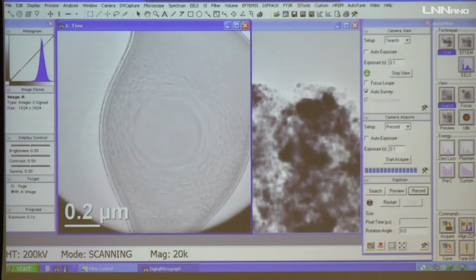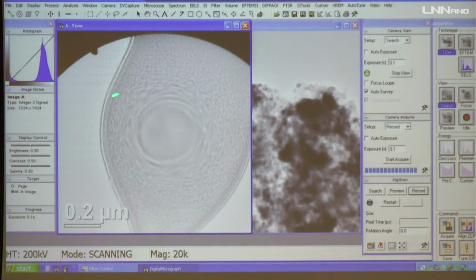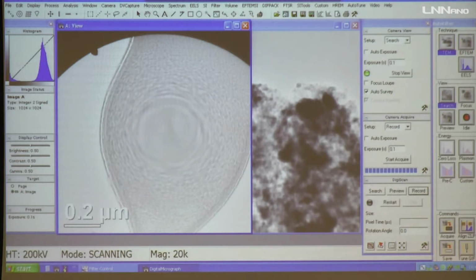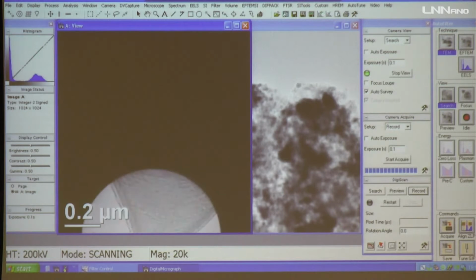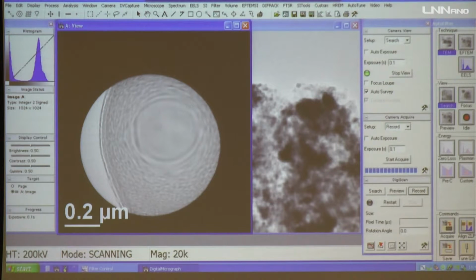Here the first one to show you, it's very large, okay? And then the idea to try to cover some of the aberrations is you can't do it, okay? And then you go to the second one, you continue to see it's not the correct size, okay?